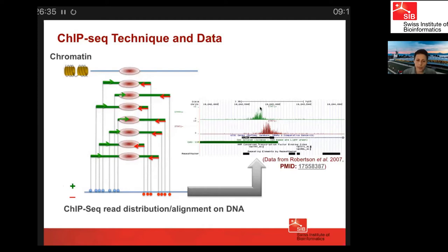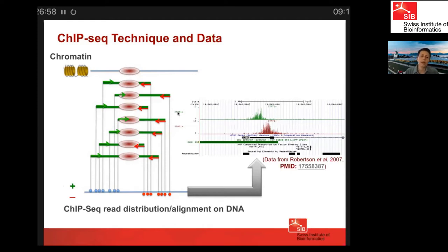Here we have a view of read alignment on a specific STAT1 locus at the UCSC Genome Browser. This locus represents the promoter region of a known STAT1 target gene, ICAM1. We see the plus strand reads in green and the minus strand reads in red.